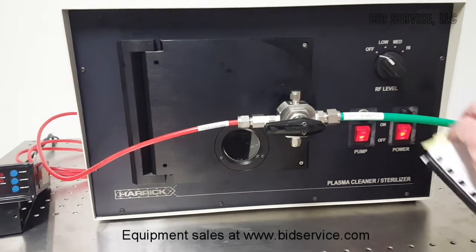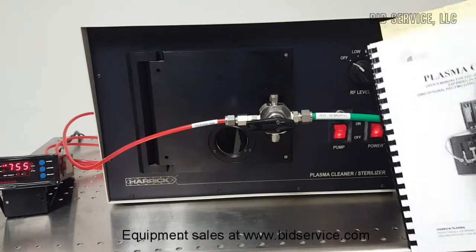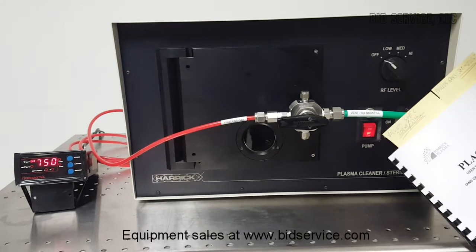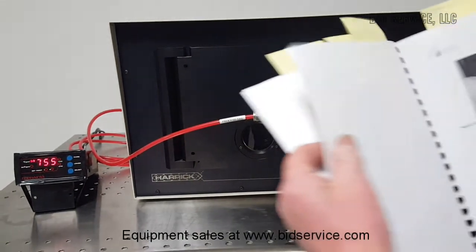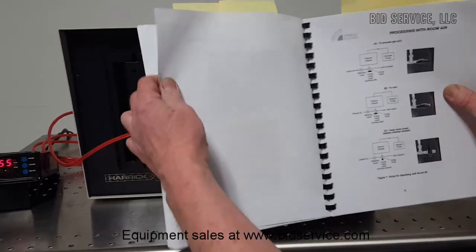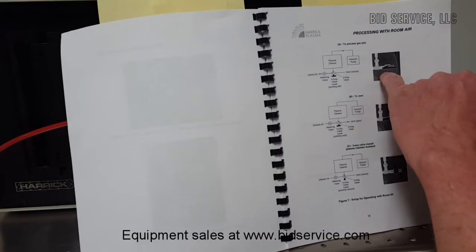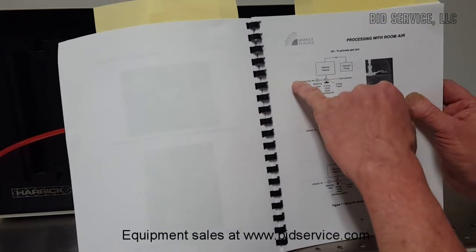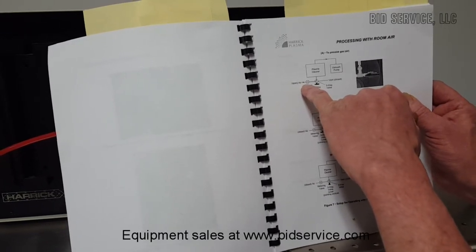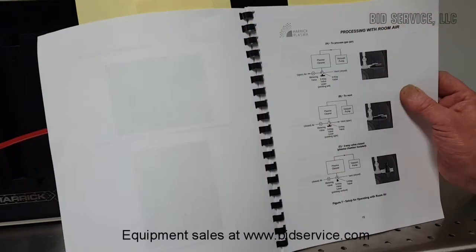The manual is exceptional. It not only gives very good descriptions, but also provides plenty of pictorials that explain exactly how these valves work. We've set them up to work the same way and they are very easy to operate. For example, if you want to process with room air, it shows you that the left side is where your metering valve is to introduce process gas, the right side is your vent, and directly vertical pumps just the chamber.